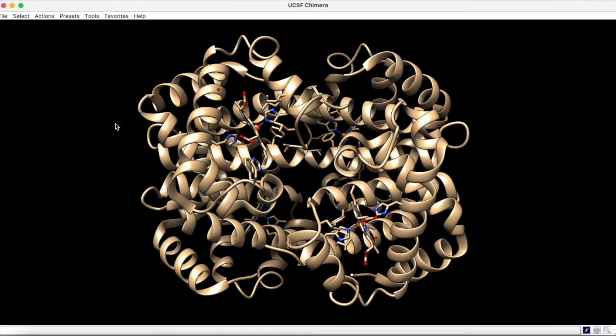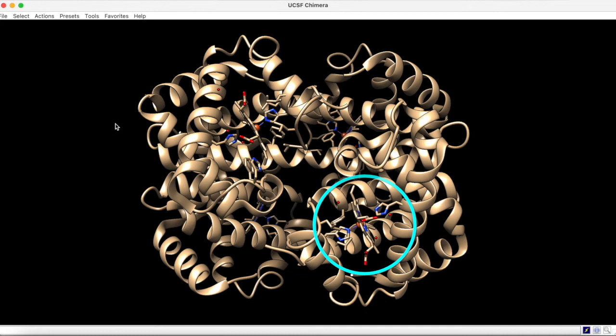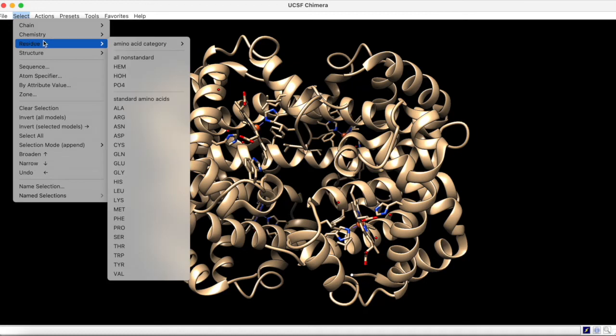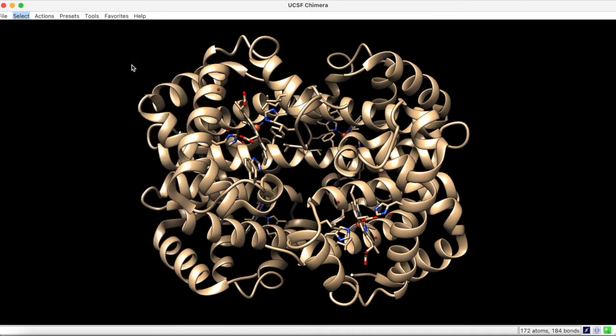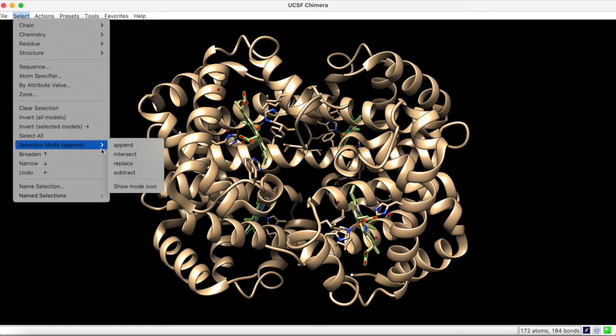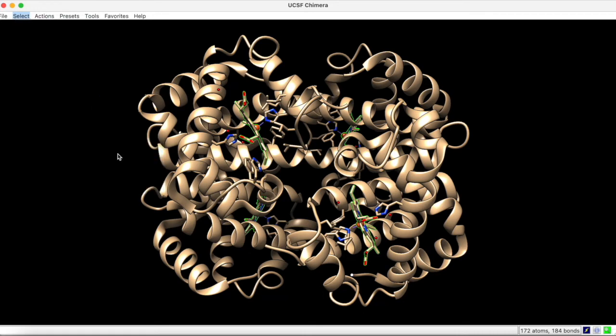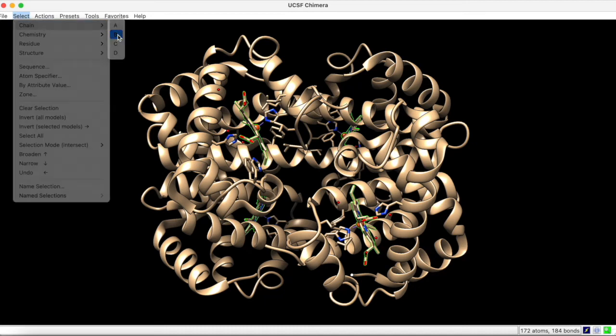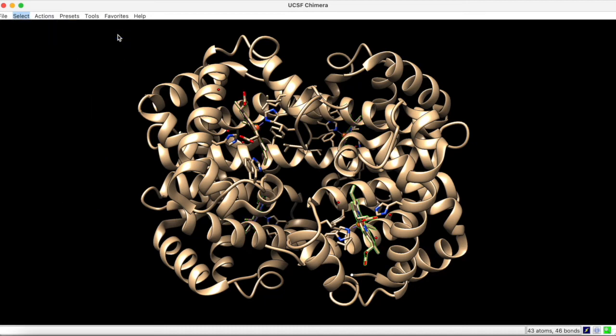Let's say you wanted to select the heme group bound to chain B. To do this, you would start by selecting under Residue in the non-standard category, the heme. However, this selects all four heme groups in the structure. But we can solve this problem by intersecting the selection with a selection for chain B. Now, only the heme group associated with chain B is selected.